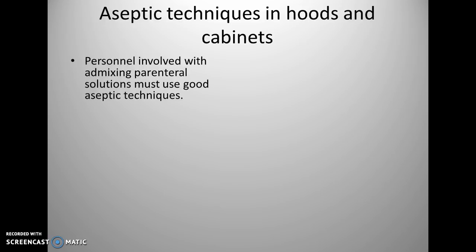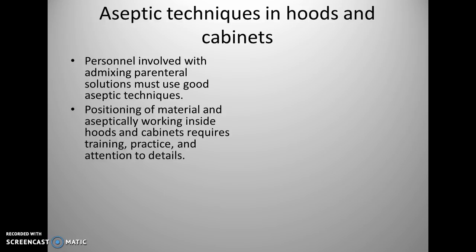1. Personnel involved in admixture of parenteral solutions must use good aseptic techniques. Positions of materials aseptically working inside hoods and cabinets require training, practice, and attention to details. Never sneeze into a hood. Never sneeze out. Okay, if you need to sneeze, you need to turn your head. And what is suggested is you sneeze within your elbow.